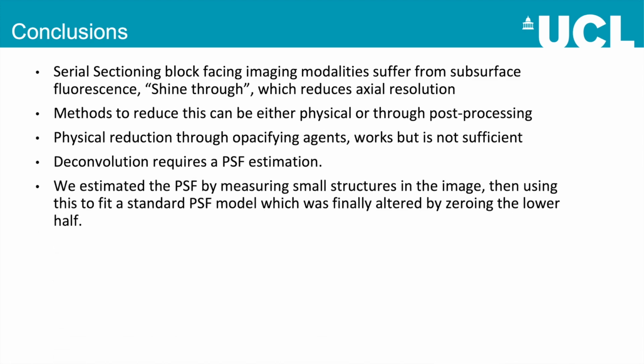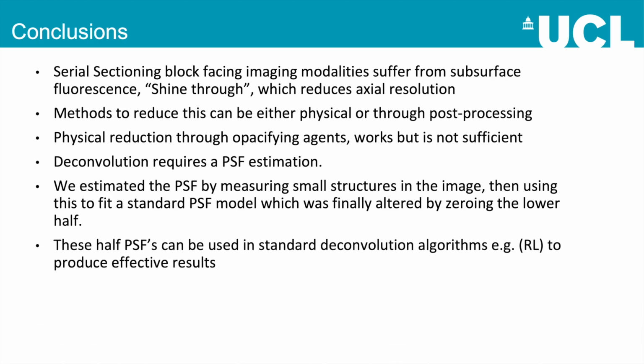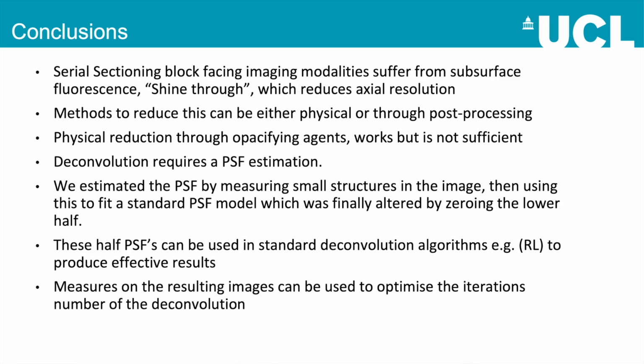We estimated this point spread function using small structures from within the image stack. We used these small structures to fit a standard PSF model, and finally we altered this synthetic model by zeroing the lower half of it. So these half PSFs that we produced were used in the standard deconvolution algorithm, the Richardson-Lucy, and produced effective deconvolutions. By quantifying some measurements on the image stacks and the segmentations, we were able to get an objective criteria for how to optimize the number of iterations.